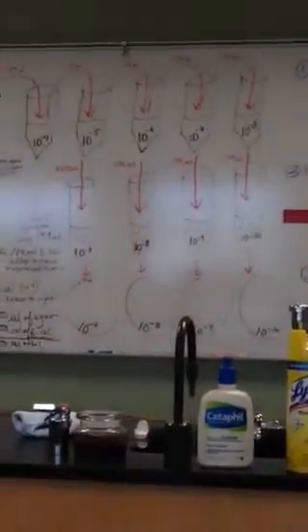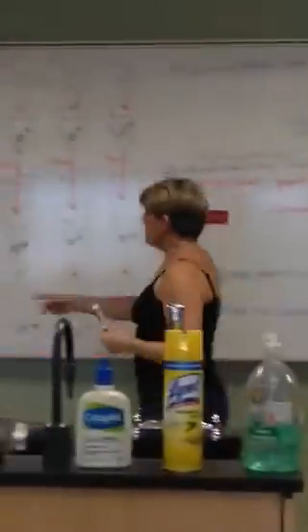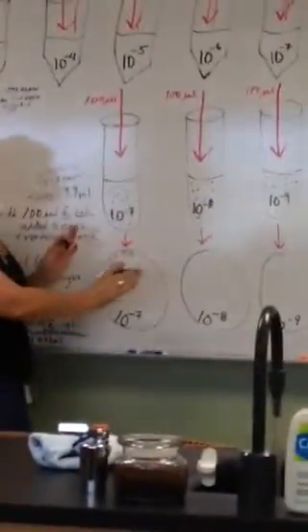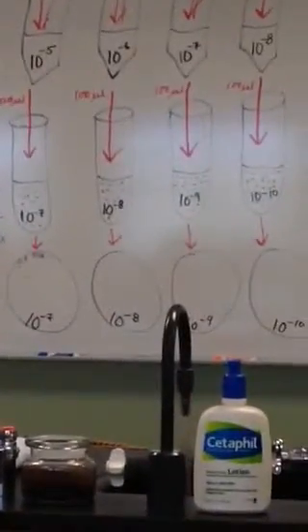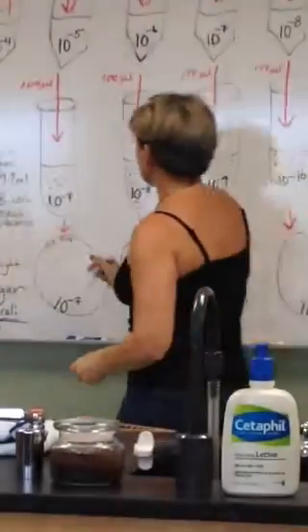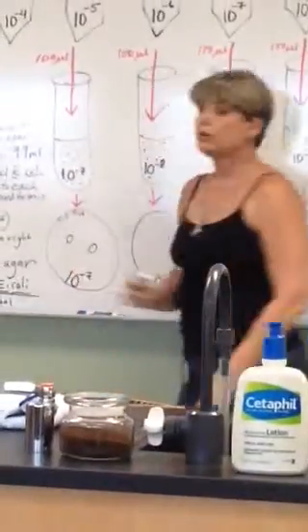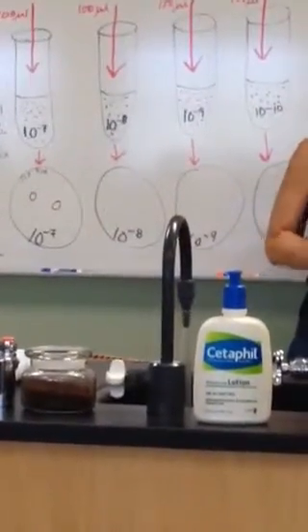When I come back on Thursday, I'm going to look at my plates, and I'm going to decide, maybe this one has, imagine the whole plate is cloudy. The whole plate's cloudy. And then I'm going to have some clear plaques on it. So maybe this plate only has 2 plaques. It's not really a good number to count. Low numbers are usually not too reliable.